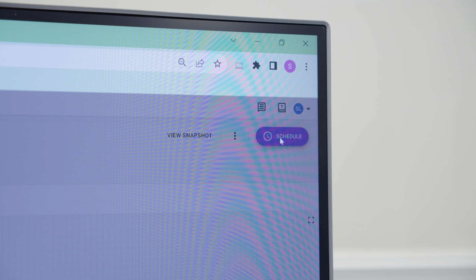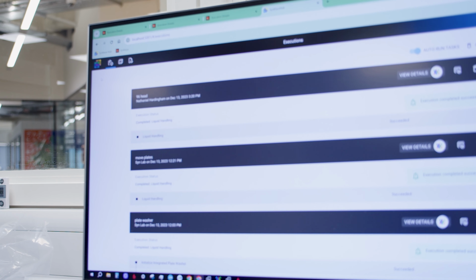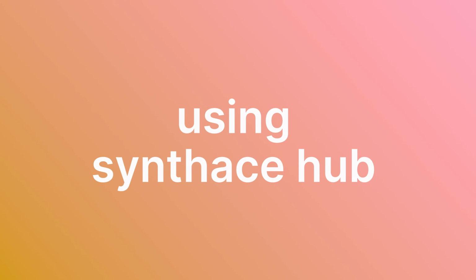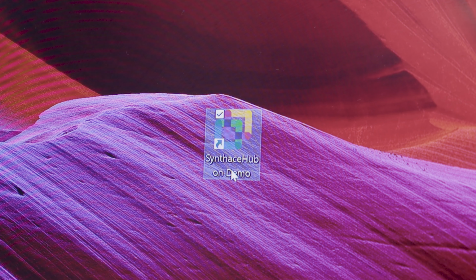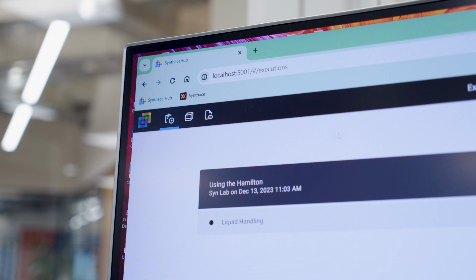This will turn that simulation into an execution, which will pop up on a local software called Synthace Hub, which will be on the computer next to your Hamilton. So open up Synthace Hub and navigate to the Executions tab, and you'll see your execution there.